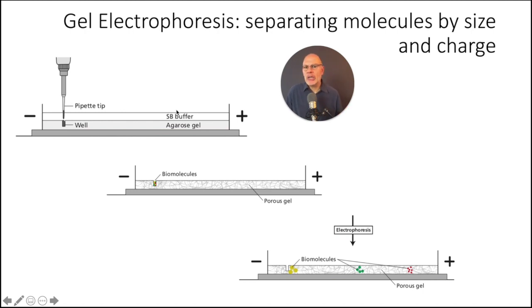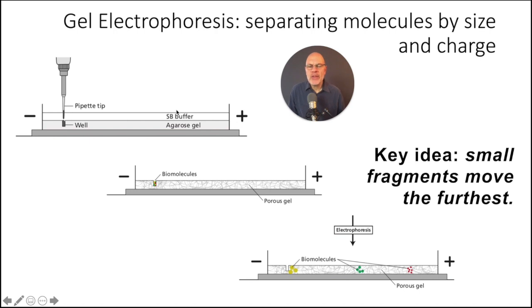And what do I mean by charge? Just think about what you know about molecules. Molecules have functional groups attached to them. So for example, a phosphate group is a negatively charged molecule. That's one example of a charge, and using charges like that, you can move molecules around.